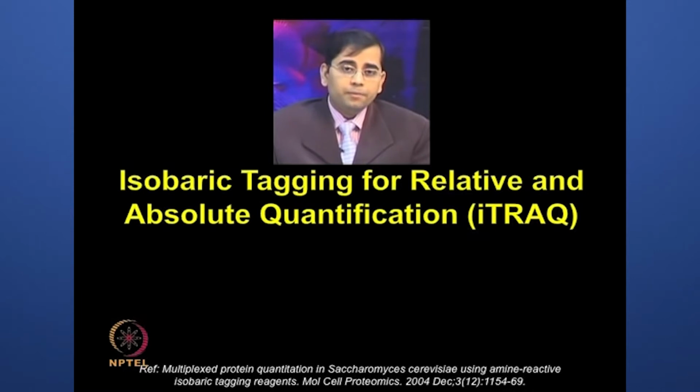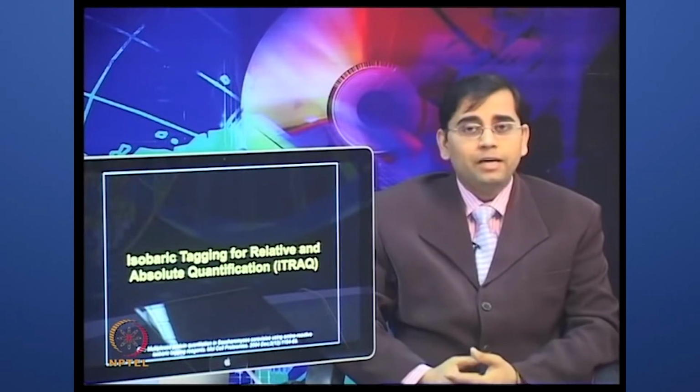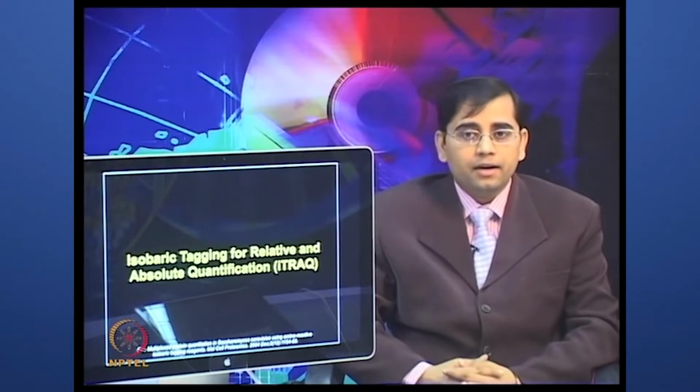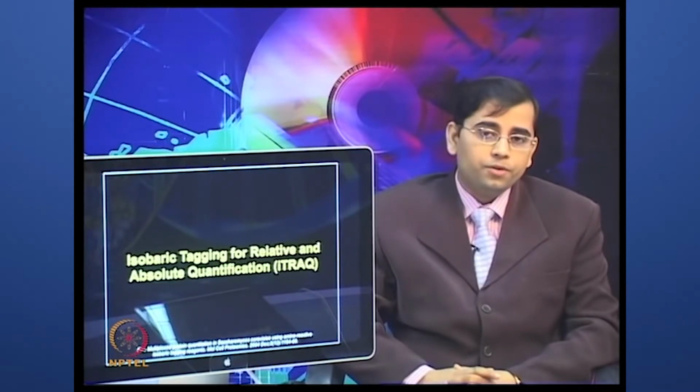And these labels can be provided in the proteins where they are N-terminal. The iTRAQ labels from Applied Biosystems and tandem mass tags labels from Thermo Fisher are currently the only commercially available tagging technologies where quantitation is carried out in MS-MS mode.